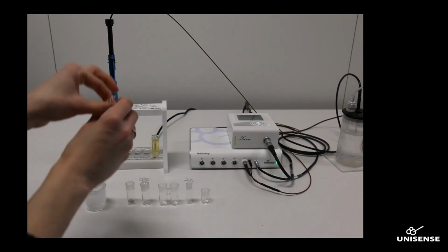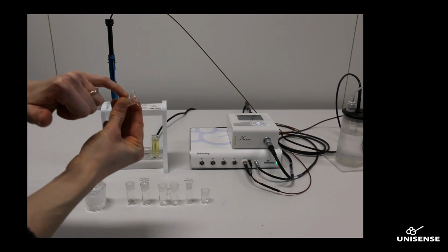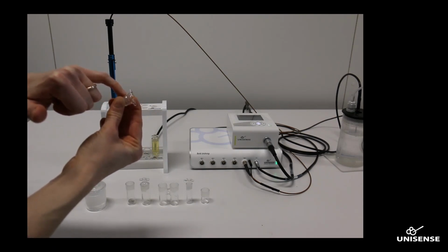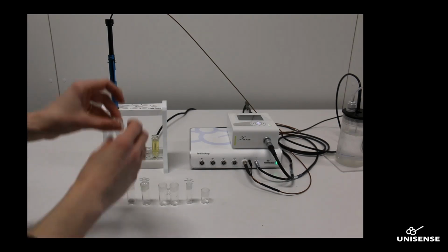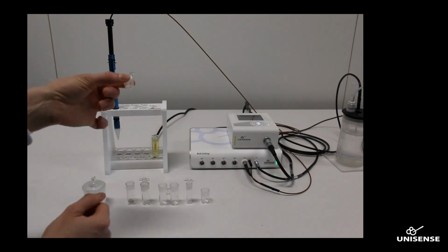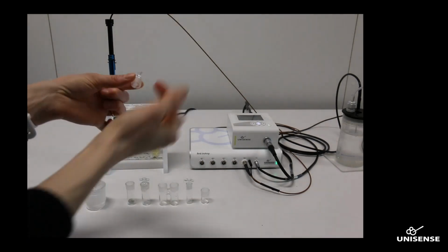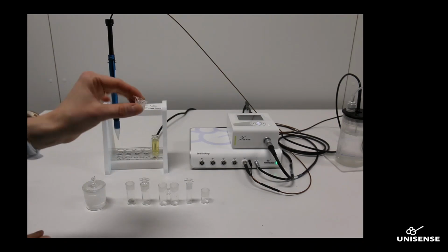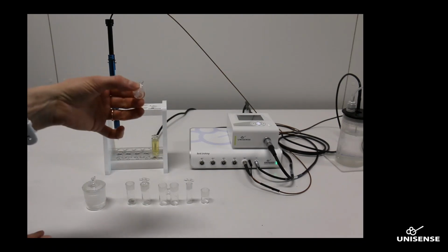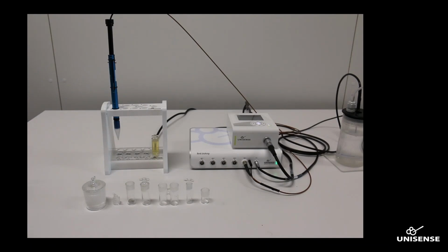We also have these injection lids, and they have an extra capillary hole where you can, with a needle, inject the substance into your sample. The diffusion in and out of the chamber is slow when the chamber is closed. This is because the capillary where the sensor tip is inserted is so long and narrow that the diffusion is so slow that we can eliminate it from our measurements.